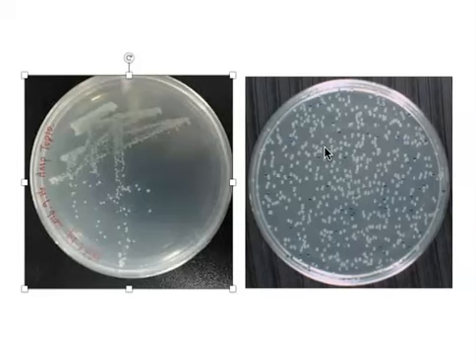Colonies can have many thousands of cells in them because in a 24-hour period, that's how many times that original bacterial cell will divide until we end up with a mass of cells that we can actually see with our eyes. Now, a spread plate is particularly useful when we want to count colonies. And the reason we would count colonies is because it will give us an estimate of how many cells were in the original sample. More colonies means that there were more cells in that original sample that we spread on the plate.